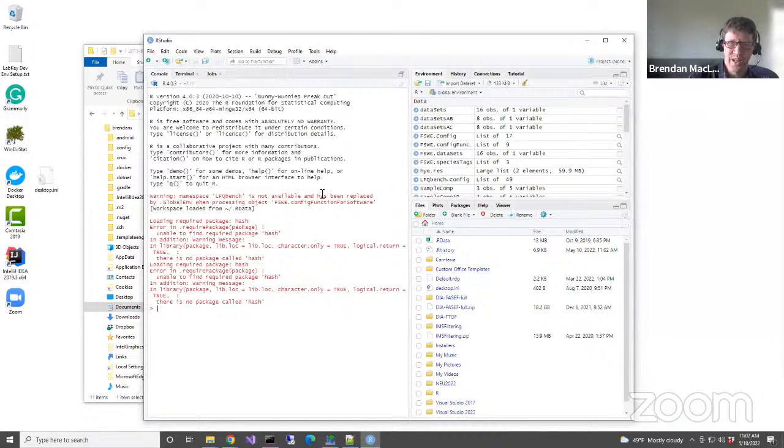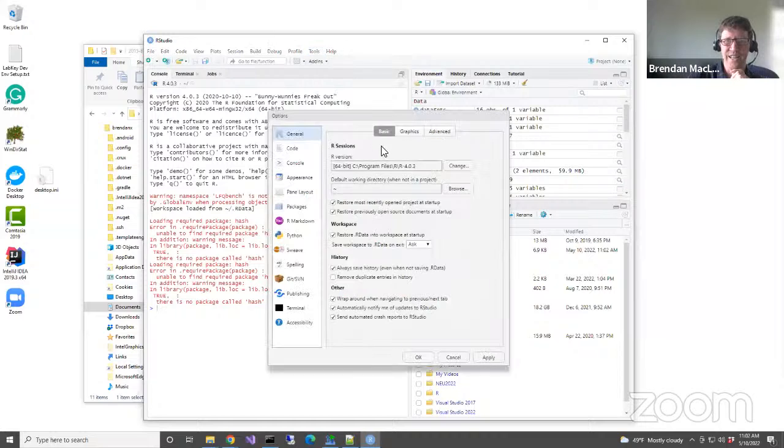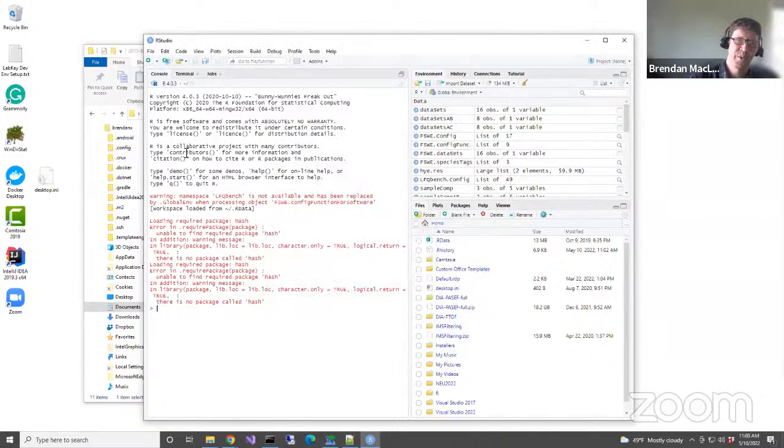When you install MS Stats, you're going to install it into a specific version, so you need to make sure that you have the version you want in here. Because if you have some other version, you're going to end up trying to install into that version. So if you had 4.2, you would try to install MS Stats into R 4.2, which is not what we want. We want to install it in here. And what we're going to do is click Open.